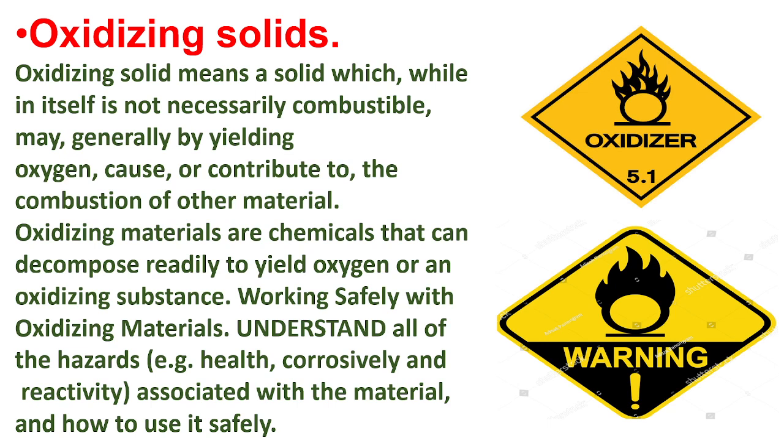Oxidizing solids. Oxidizing solid means a solid which, while in itself is not necessarily combustible, may, generally by yielding oxygen, cause, or contribute to, the combustion of other material. Oxidizing materials are chemicals that can decompose readily to yield oxygen or an oxidizing substance. Working safely with oxidizing materials: understand all of the hazards associated with the material, and how to use it safely.